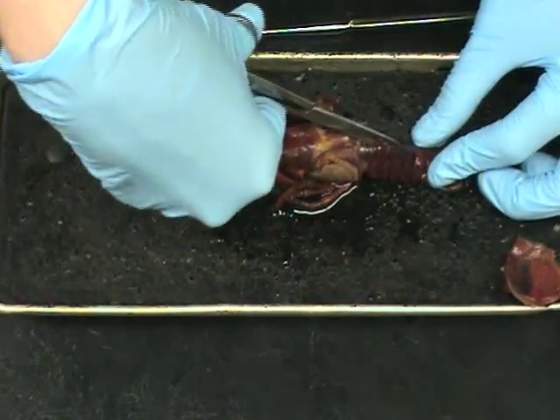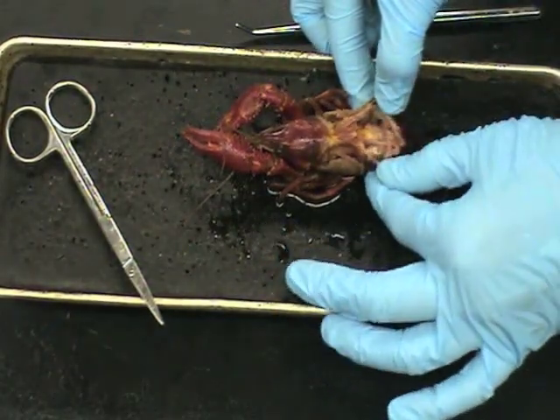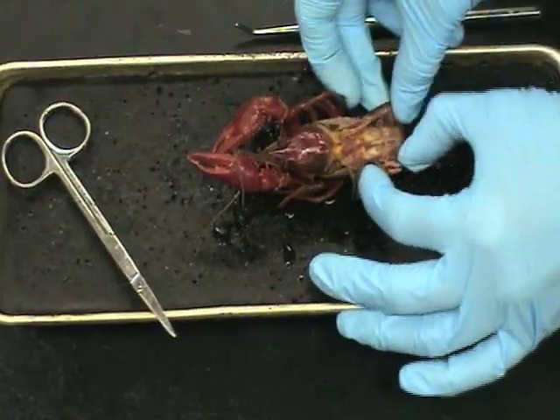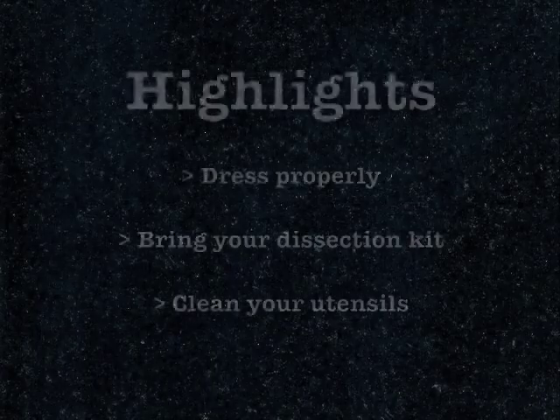Cut at an upward angle down the tail to expose the intestines. After you have observed and identified the organs, dispose of your crayfish in the proper trash.